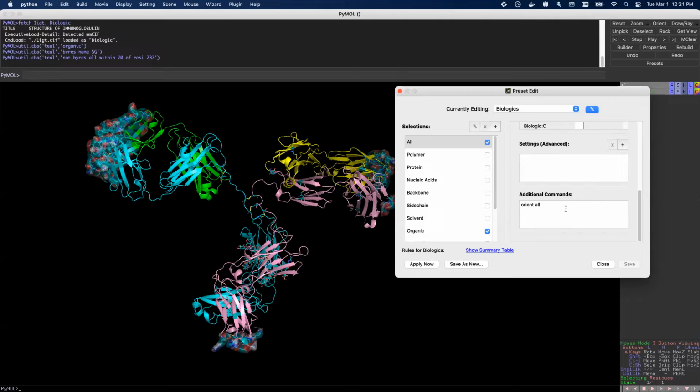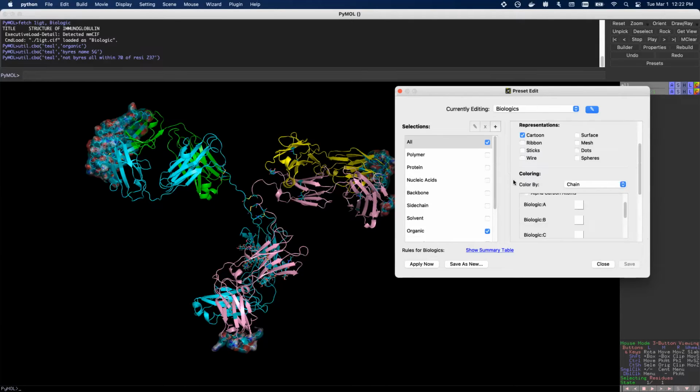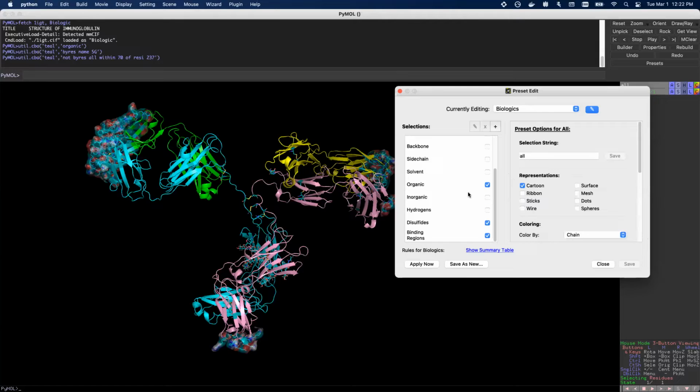We're still working out how this should actually be implemented, but for now, it's just like running any other script, but it's meant to give, again, as I mentioned before, empowering our power users. If you have particular commands that you want to run, this is the best place for that. So this is a very basic selection, but let's look at something more interesting, right?